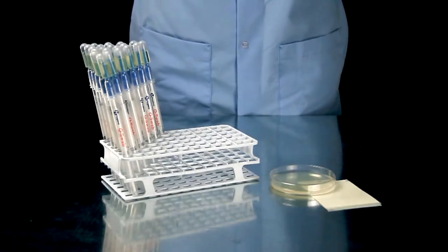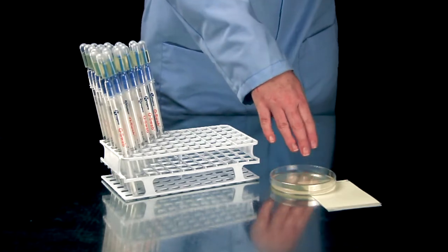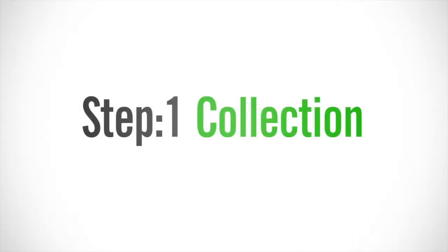The materials you will need include a Q-Swab and either an agar plate or dehydrated media film. The first step is collection.